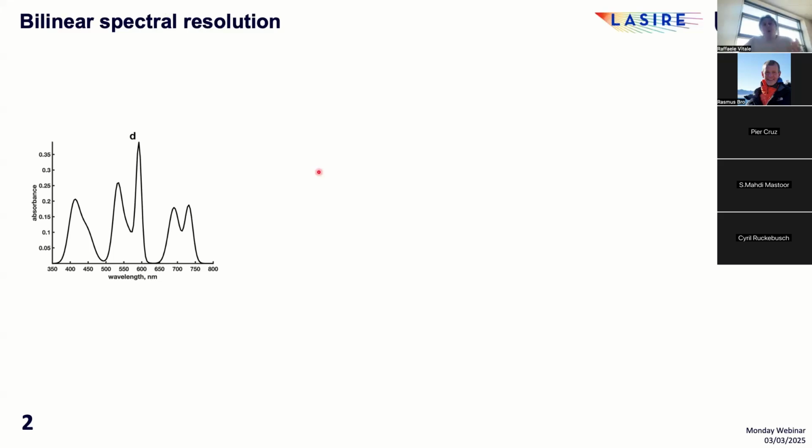Now, I'm almost sure that most of you already know that in spectroscopy, one often exploits analytical platforms providing signal profiles called spectra, which basically give insights into how light interacts with investigated samples.